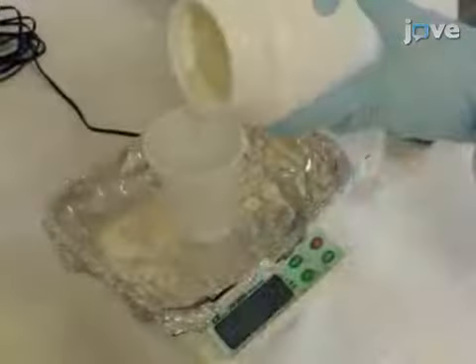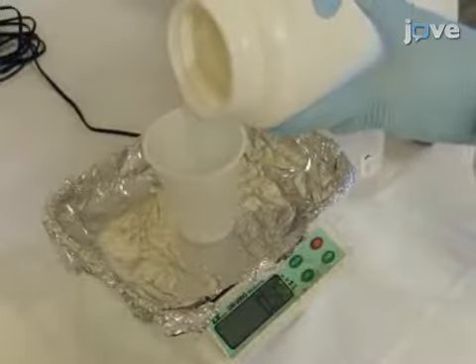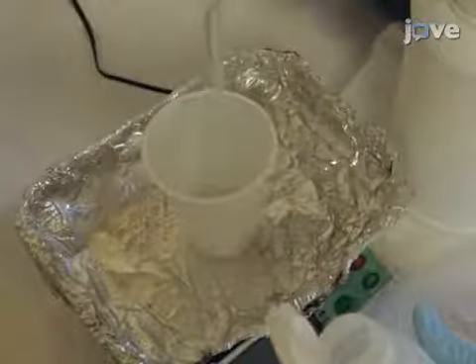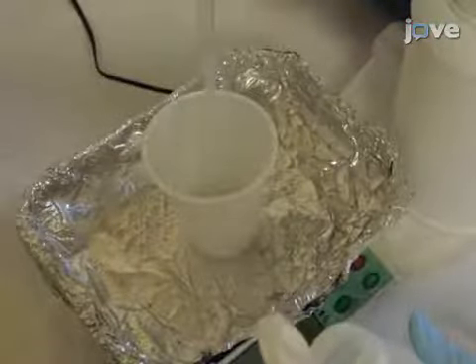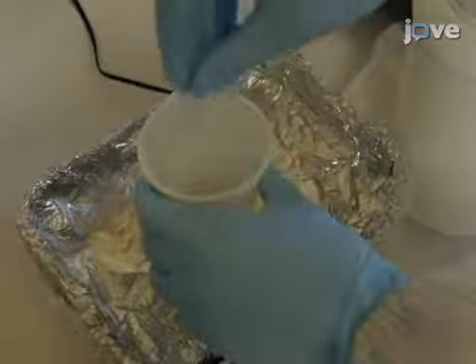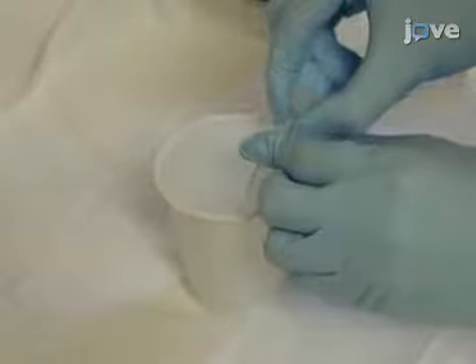Then add 5 grams of component A and 0.5 grams of component B of the PDMS in a 150 milliliter plastic container and use a toothpick to manually stir it. Load the mixture into a 10 milliliter syringe. Then, with the syringe, inject the PDMS mixture onto the cap.